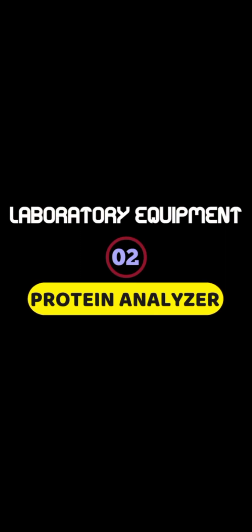Number two is protein analyzer. Protein analyzer is mainly used in determining protein or nitrogen using the Kjeldahl method. In the Kjeldahl method, three basic steps are involved, which are distillation, digestion, and titration. But this protein analyzer is mainly used in only the digestion and distillation steps.